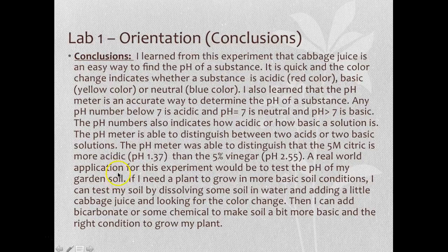In the conclusion section, which is the most important section as I had mentioned before, this is where you state whether your hypothesis was supported or not supported. So basically here my hypothesis that water and acetone are going to be neutral is supported, and that the acids are going to be acidic and so on.